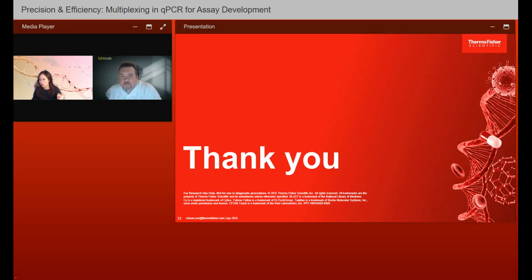And if you have a software that can align them, which I believe there's also free software like APE, you're able to align the sequences to make sure that your primer and probe, at least one, is sitting with enough mismatches with the pseudogene.